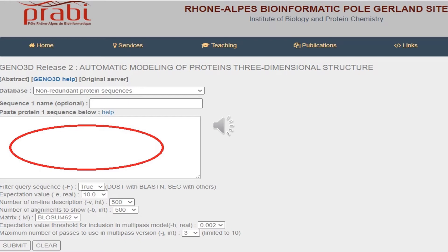When we submit the protein sequence, the server performs homology modeling in six successive steps. First, it identifies homologous proteins with known 3D structure using PSI-BLAST. Secondly, it provides the user all potential templates through a convenient user interface for target selection, where you get lots of targets and select sequences based on similarity, just as we do in BLAST.